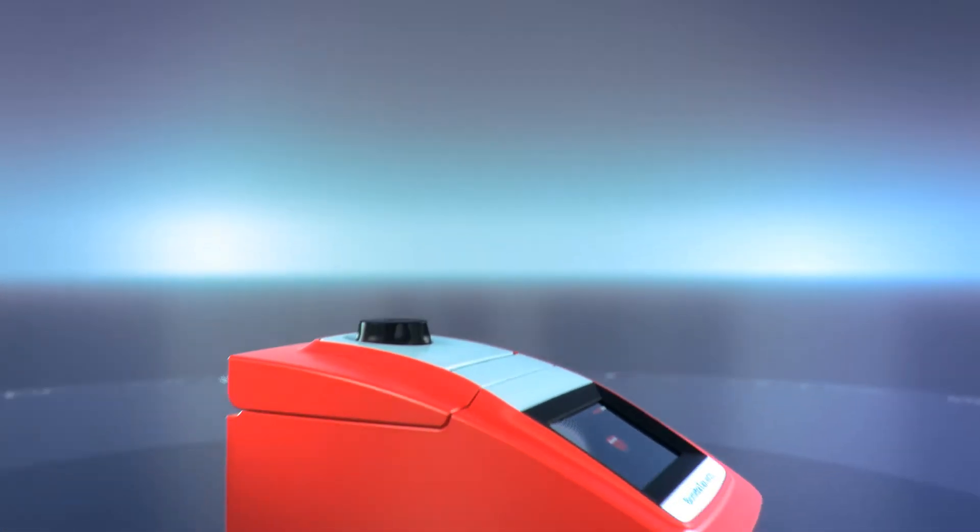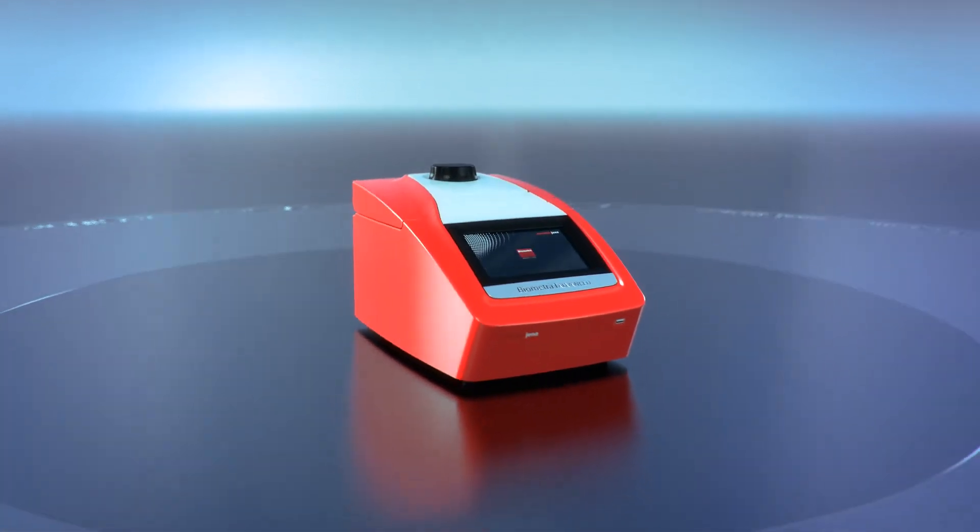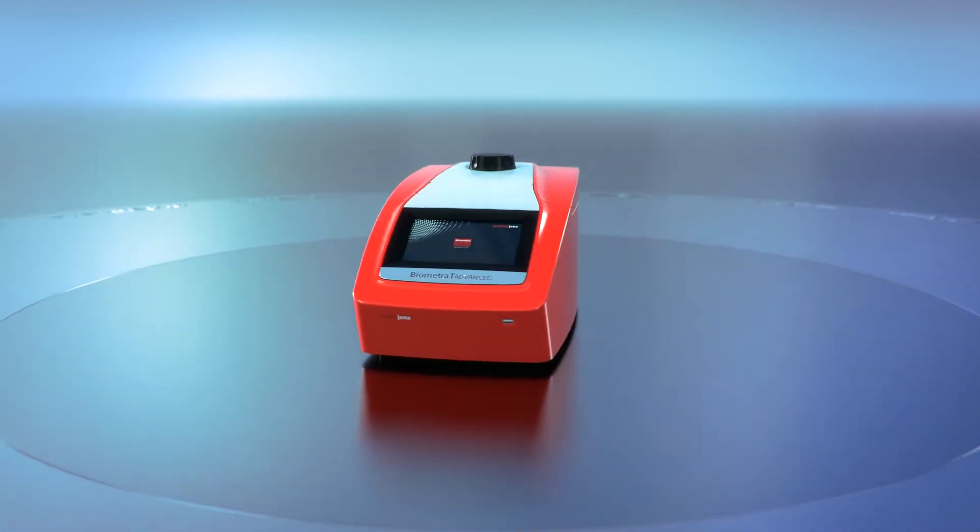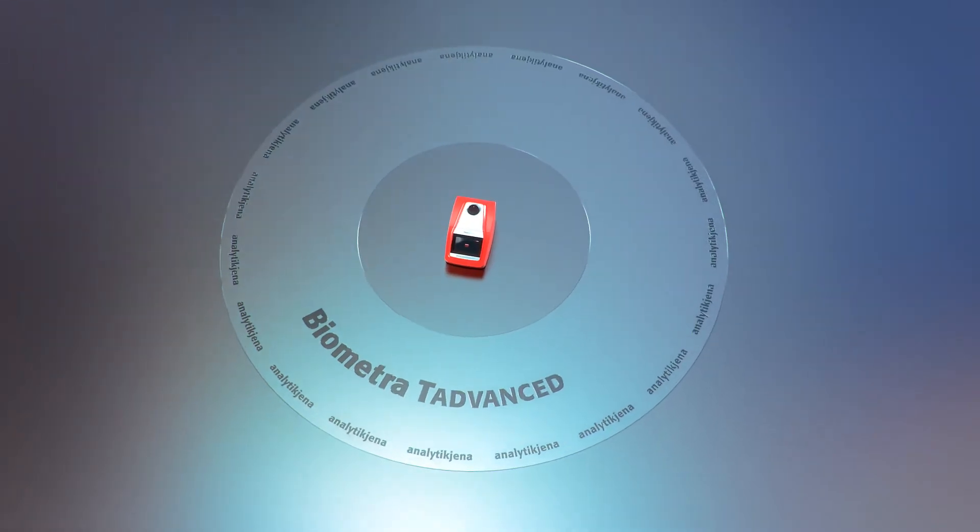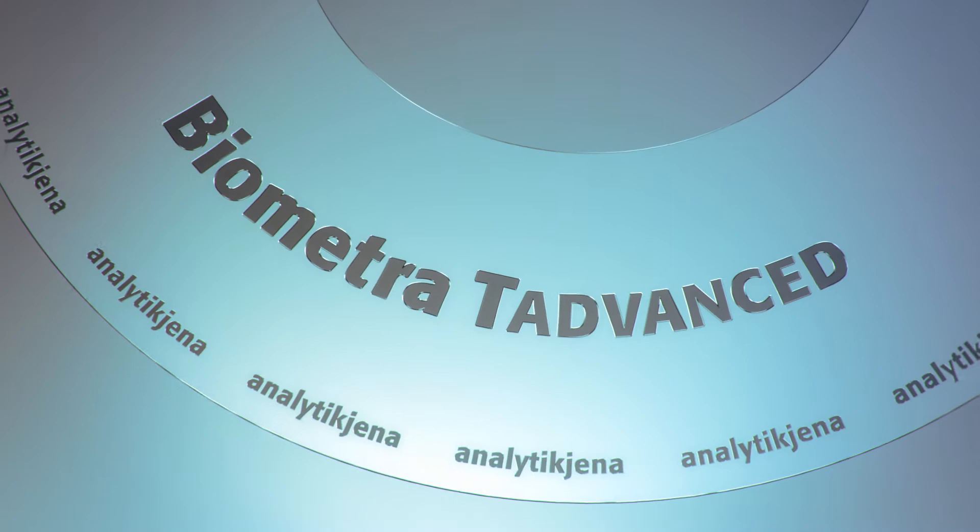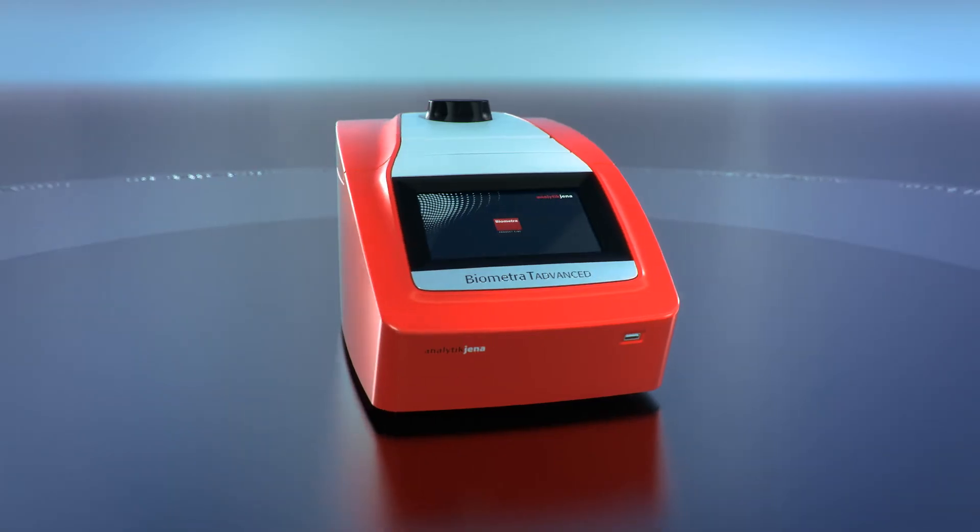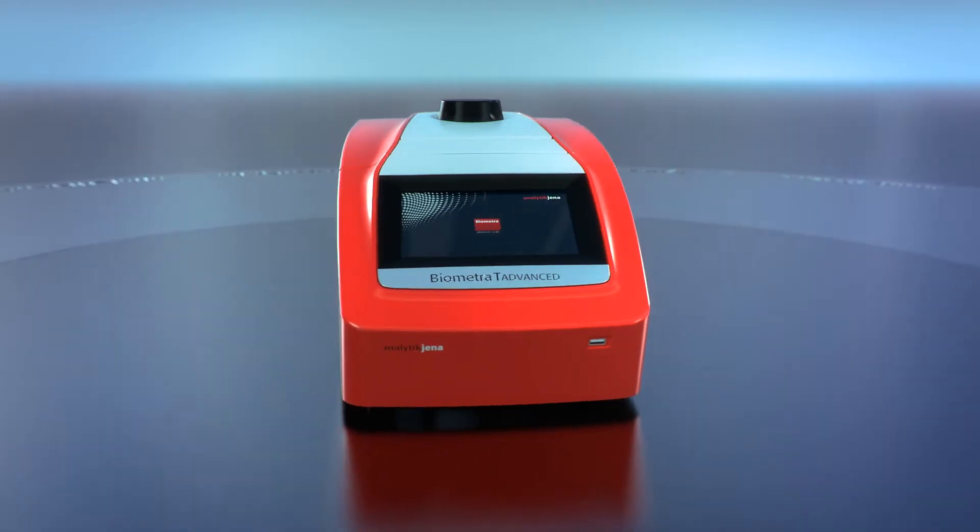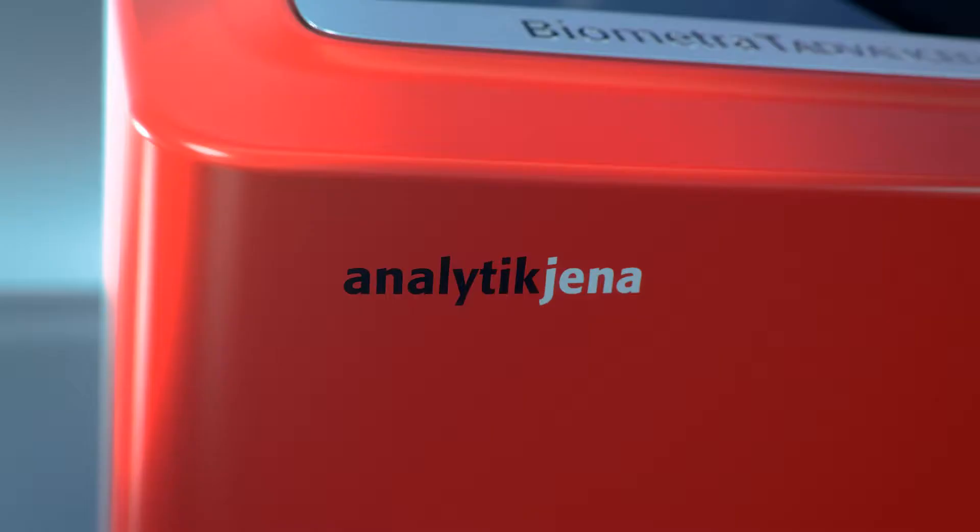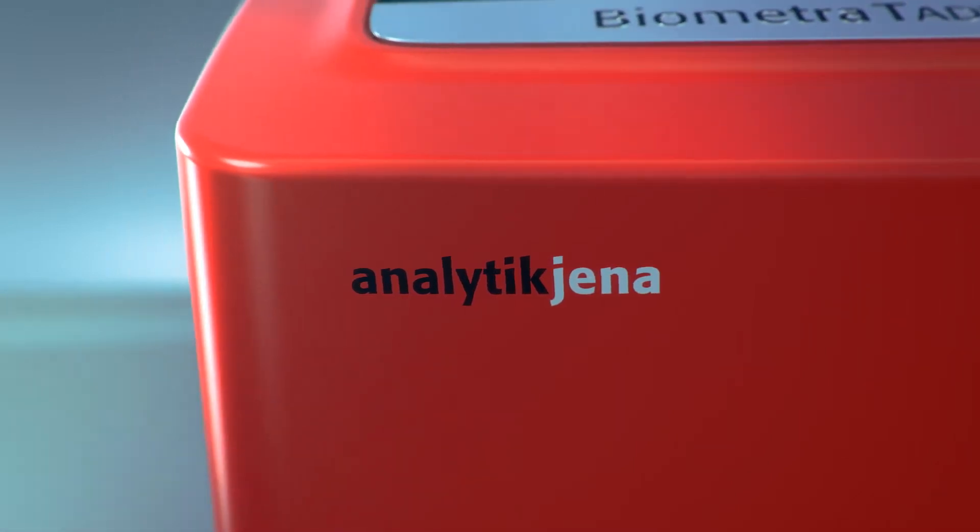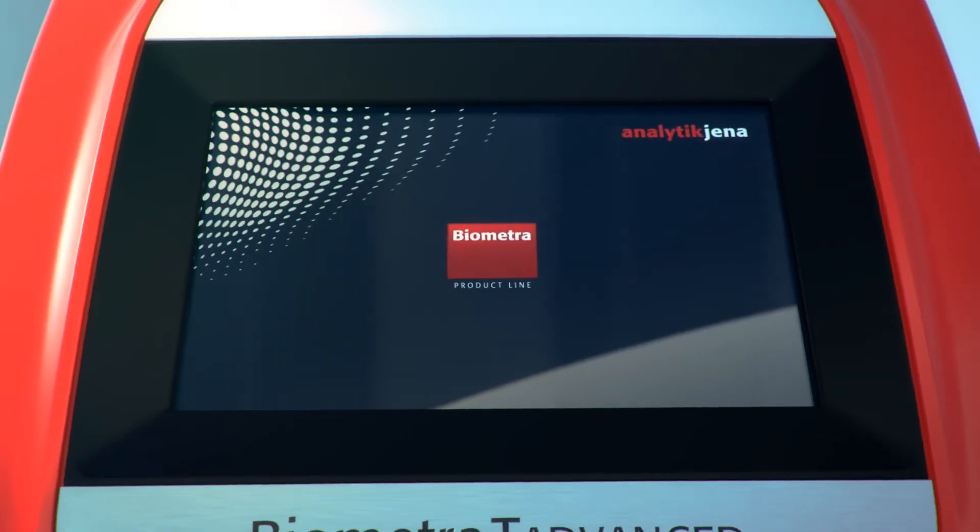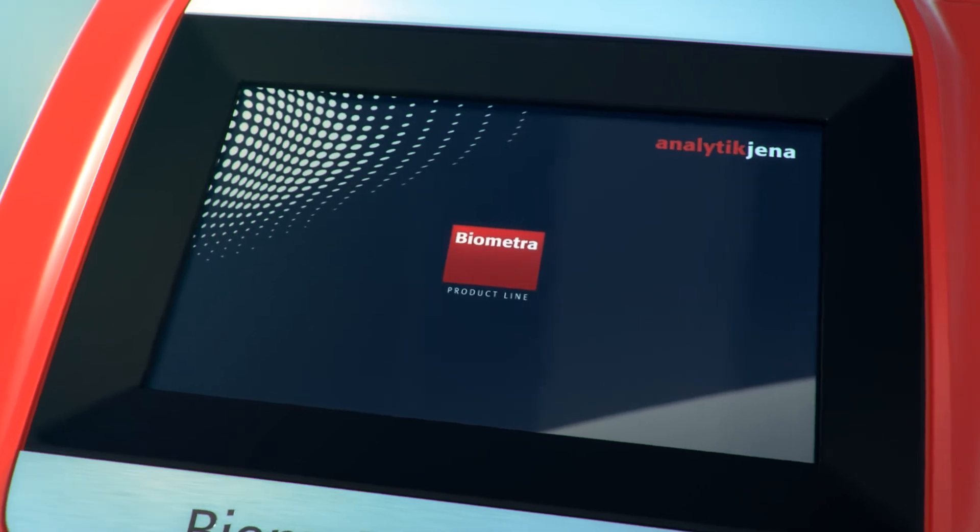No compromises in technology. The Biometra T-Advanced is a high-end thermal cycler convincing by ultra-fast heating and cooling rates for very short program run times, excellent temperature uniformity for highest reproducibility of experiments, innovative design in combination with high-quality components made in Germany.